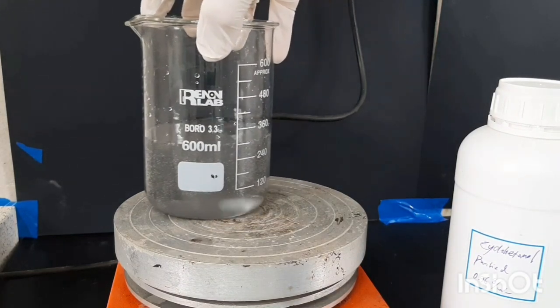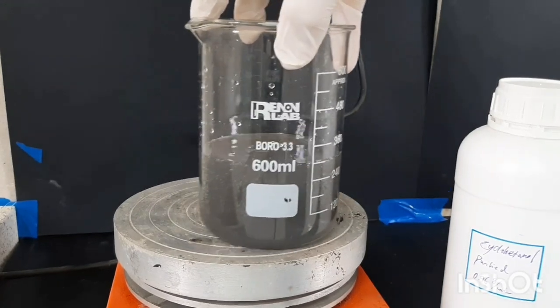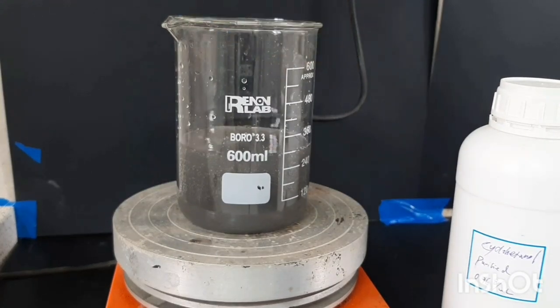Cyclohexanol has a density of 0.96 grams per cubic centimeter, melting point of 25 degrees Celsius, and boiling point of 162 degrees Celsius. I got the sample from a supplier of industrial grade cyclohexanol and I vacuum distilled it and collected everything below 90 degrees Celsius.